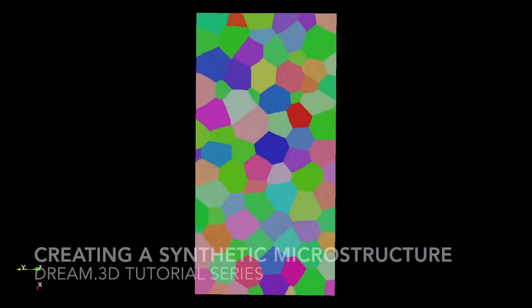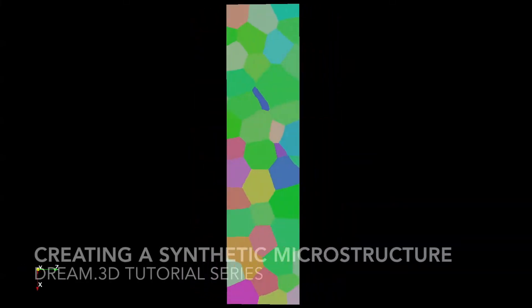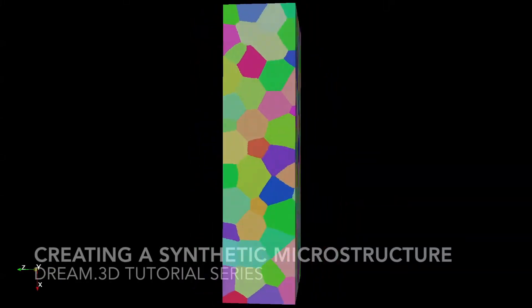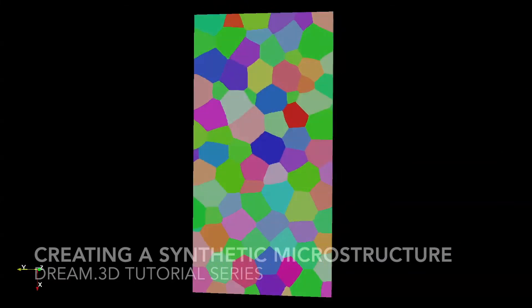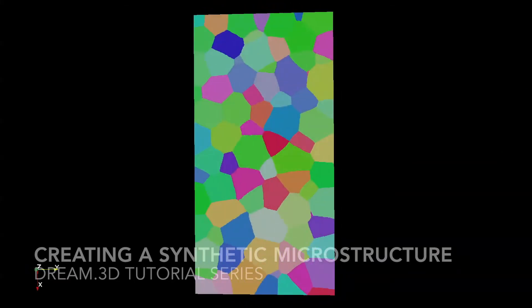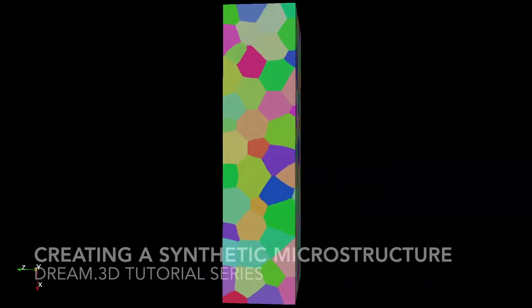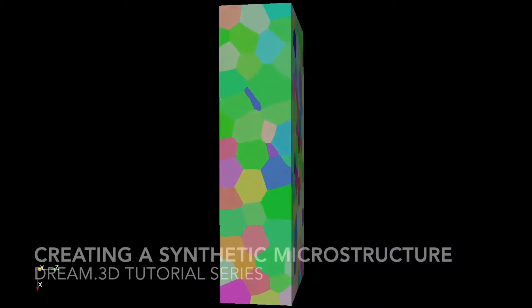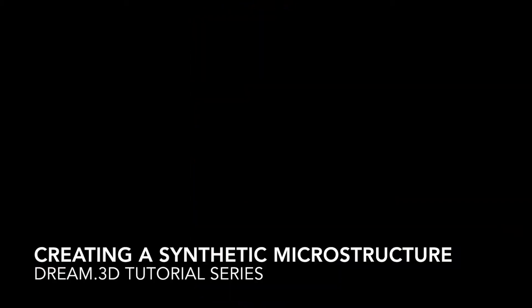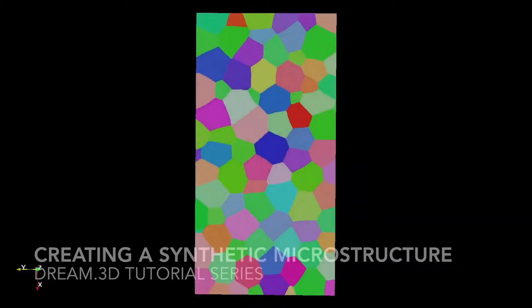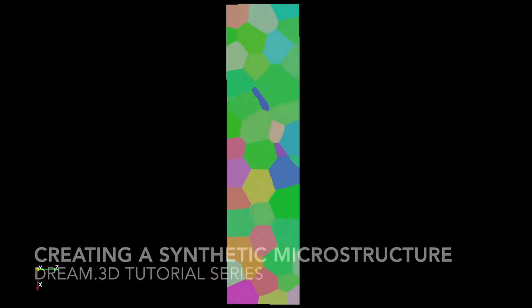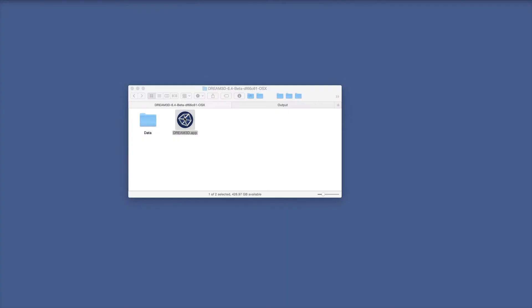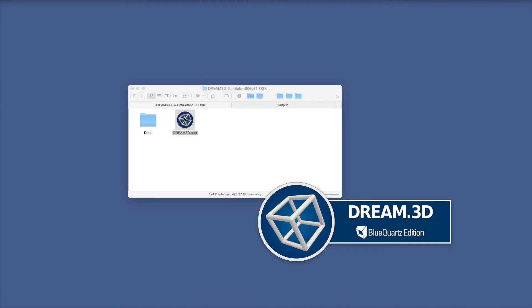Hello and welcome to this video tutorial on constructing a synthetic microstructure using Dream3D. Today, we're going to be generating a synthetic polycrystal microstructure consisting of a single phase and a target grain size of 100 microns. We're going to accomplish this by using Dream3D's stats generator and synthetic generation filters.